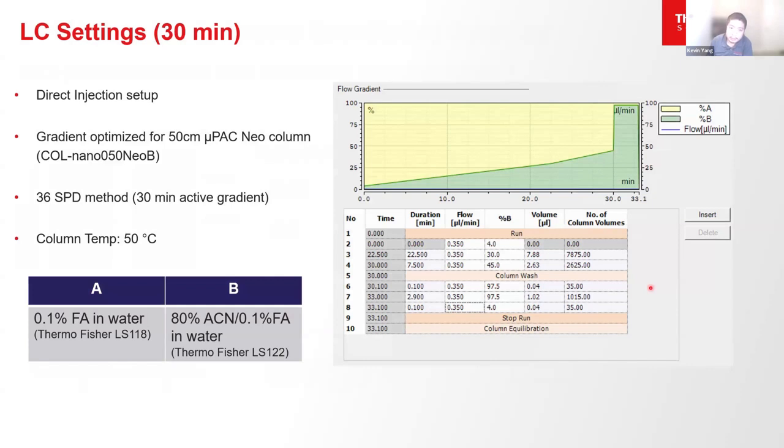So with that, let's first look at the experimental setup for our LFQ DIA workflow on the Orbitrap instrument. We have different throughputs, and I'm gonna use this 30-minute gradient as an example. So we basically have a step gradient, just like most of you are doing. And if you haven't used a Vanquish Neo before, you'll probably notice that the equilibration is missing here. And that is because on Vanquish Neo, you set up the equilibration based on the column's specification.